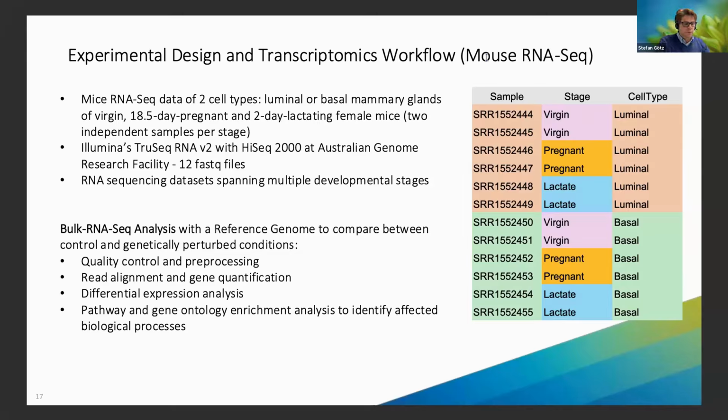So we don't need to worry about the functional annotation, at least not that much. This is something we can get online. So we can import gene ontology terms and enzyme codes and such things. So we don't have to worry about that, but still we have to do the differential expression analysis, and then we can directly hop into the combined pathway analysis to identify and see what enzymes are triggered and which genes are up and down regulated and so on and so forth.